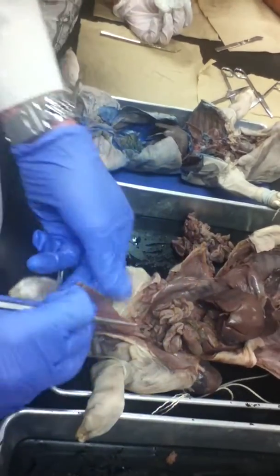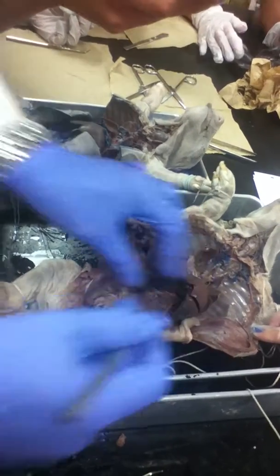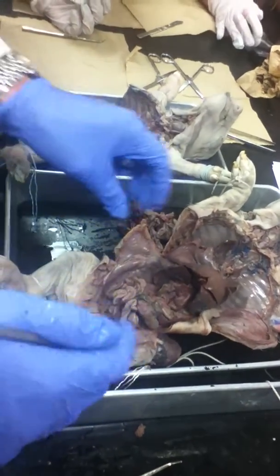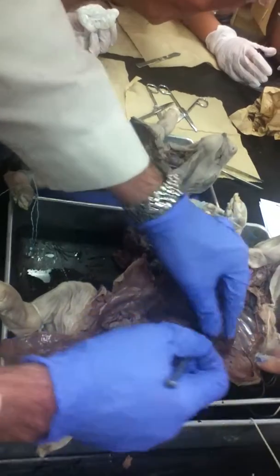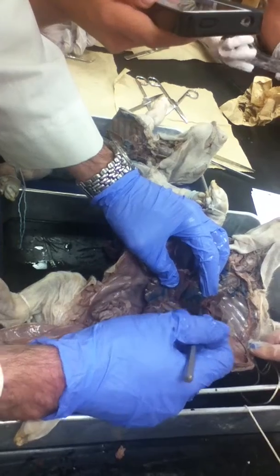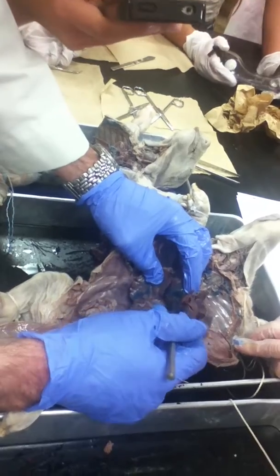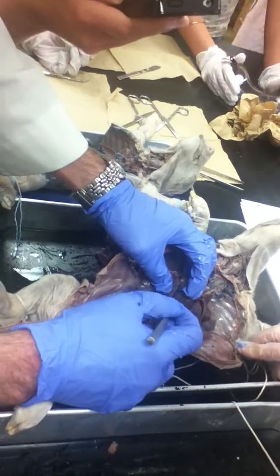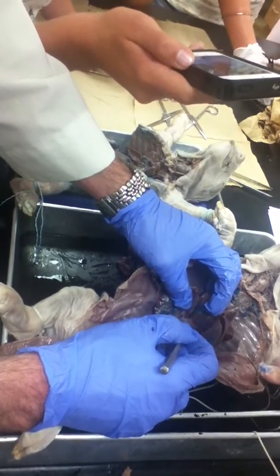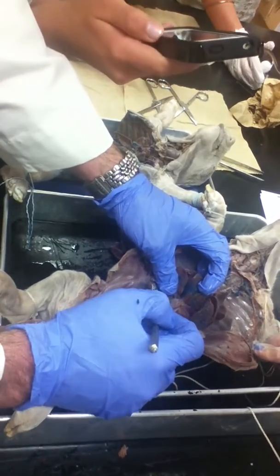The umbilical vein, which was this thing that was attached right there, which you cut, okay, which connects to the umbilical cord here, okay. That's the umbilical cord. The gallbladder is right there. That structure right there that sits right underneath the liver, that's the gallbladder, okay. The bile duct, it's very hard to see, but your bile duct is basically a little duct that goes from the gallbladder and eventually goes into the duodenum, which is the first part of the small intestine.